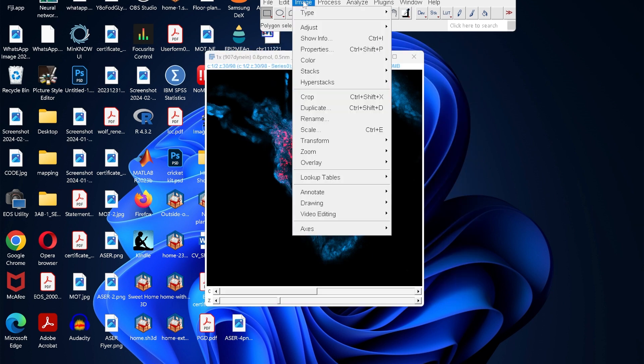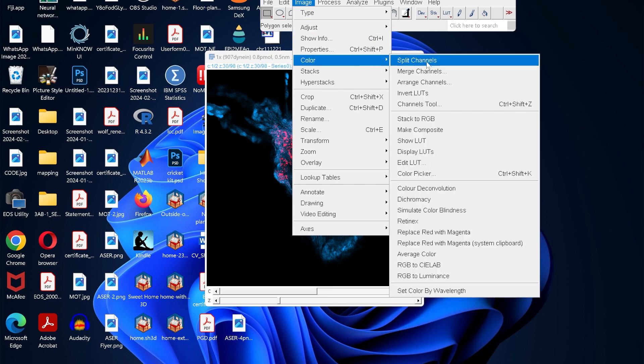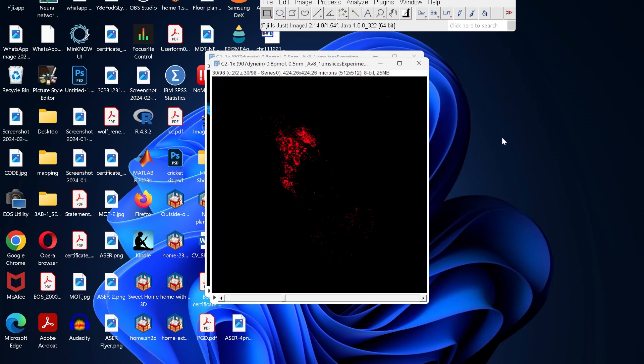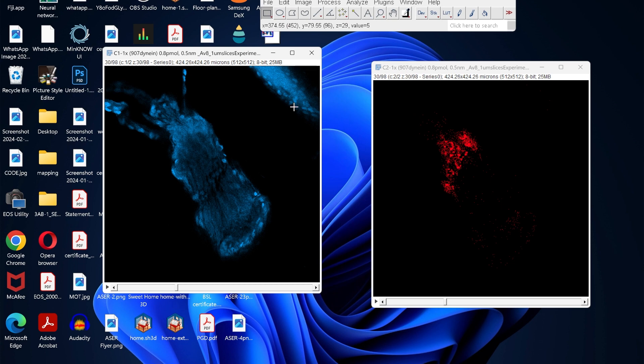All you have to do is click on the image, then color, and then split channels. That will split both the channels. In this case, we have our red and blue channel separate.